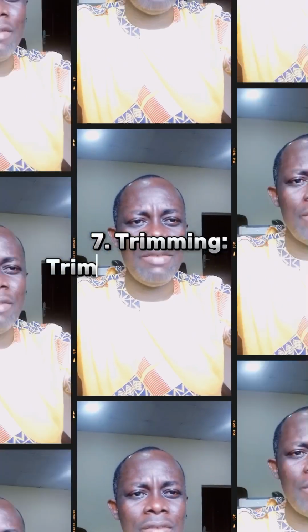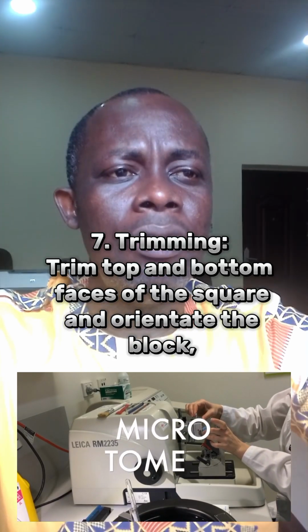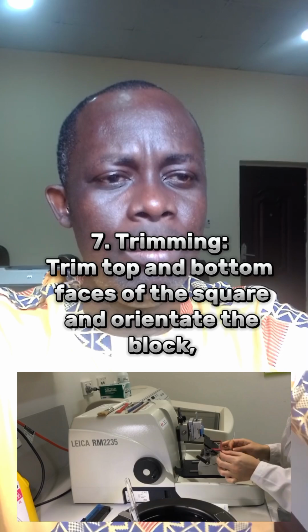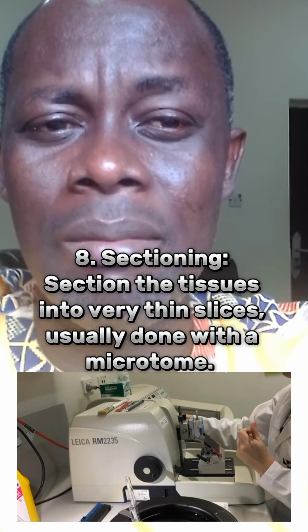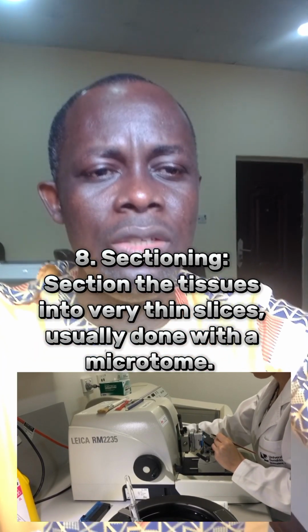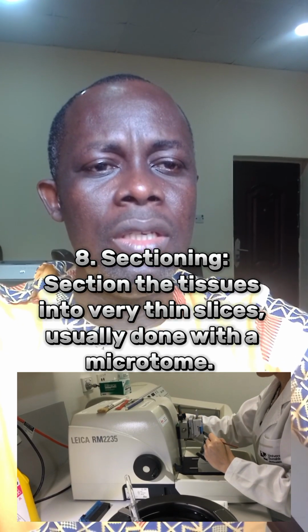That's the 7th step, trimming. In this step, you trim the top and the bottom faces of the square and oriented block so that when you section it, a ribbon is formed. Then the 8th step is sectioning. In this case, you section the tissue into very thin slices, usually done with the microtome.